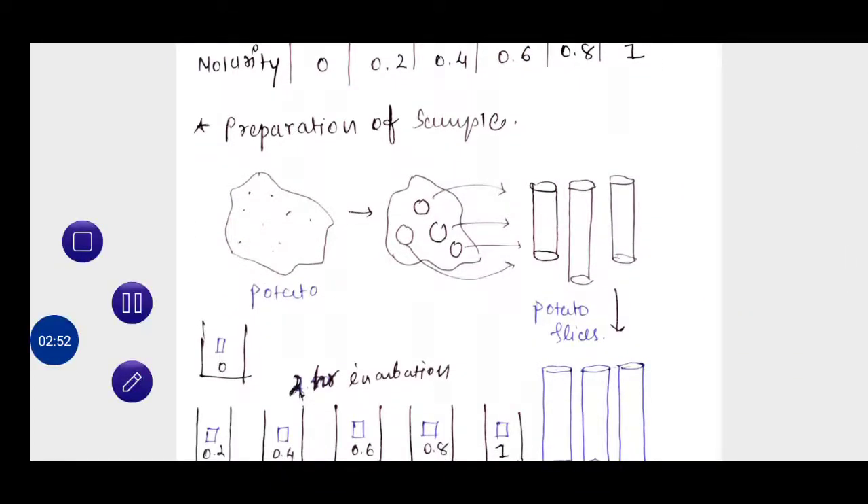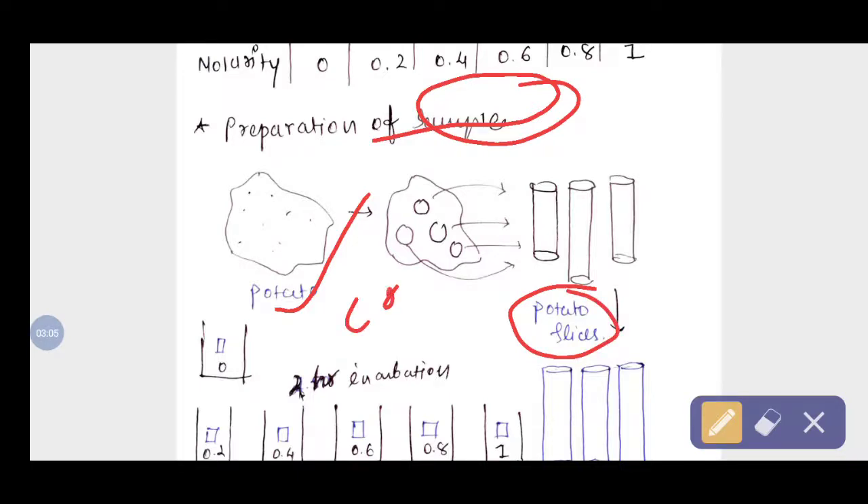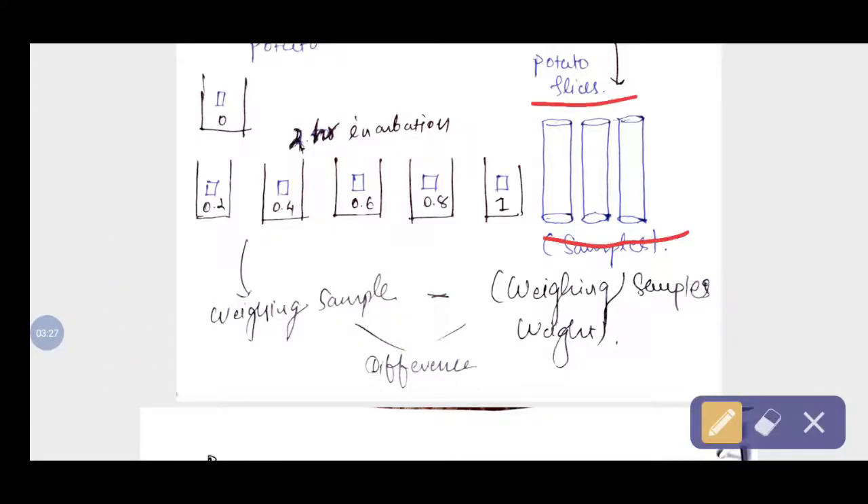In the second step, we prepare the sample — the plant tissue. We take one potato and make round potato slices using a cork borer. We take a total of six slices and cut them to the same size and same length. After cutting, we take the initial weight of each slice and note it down.